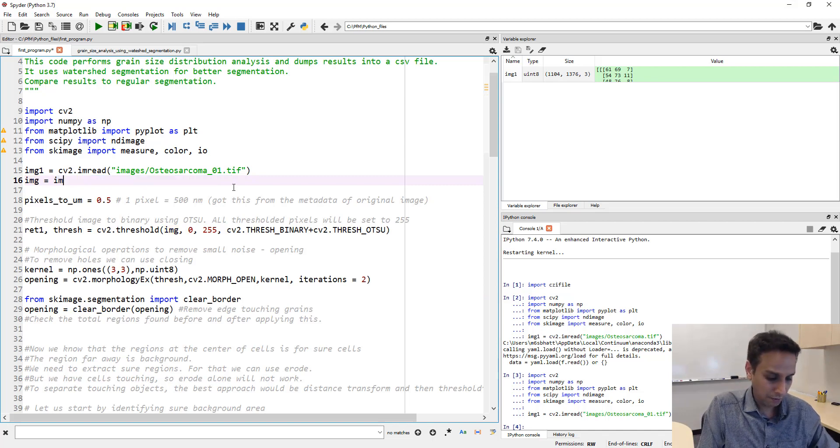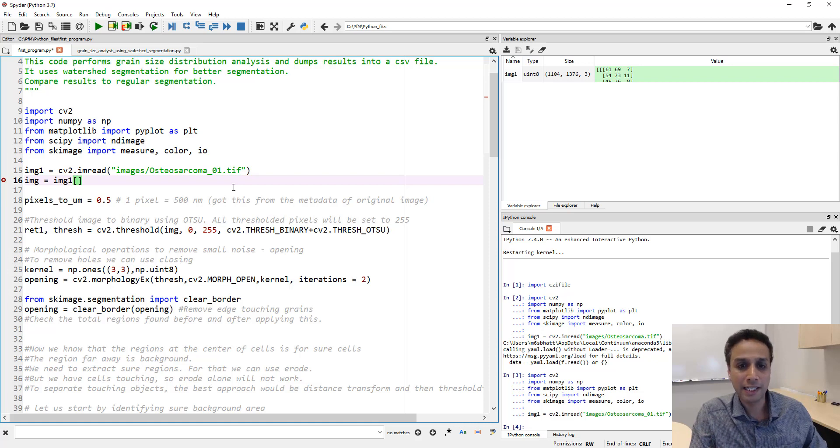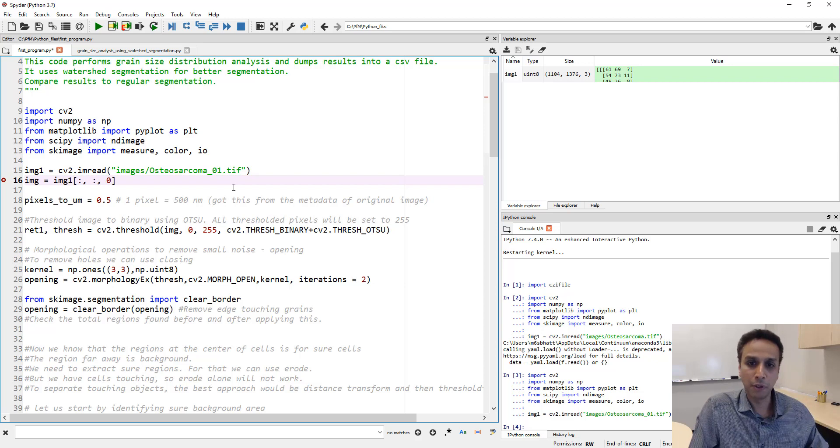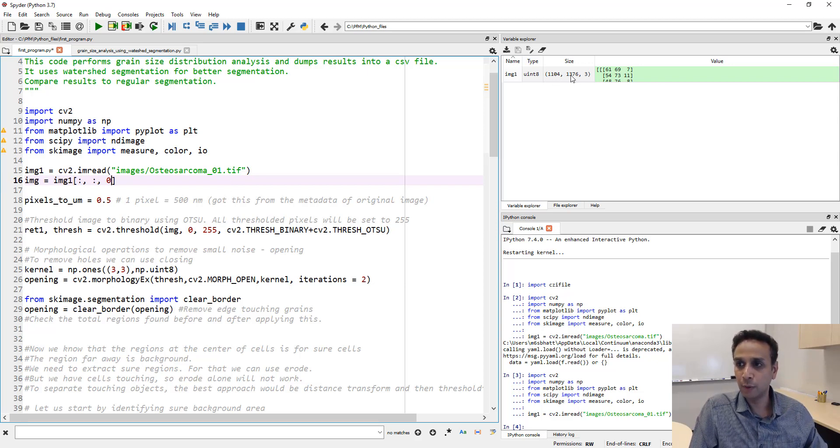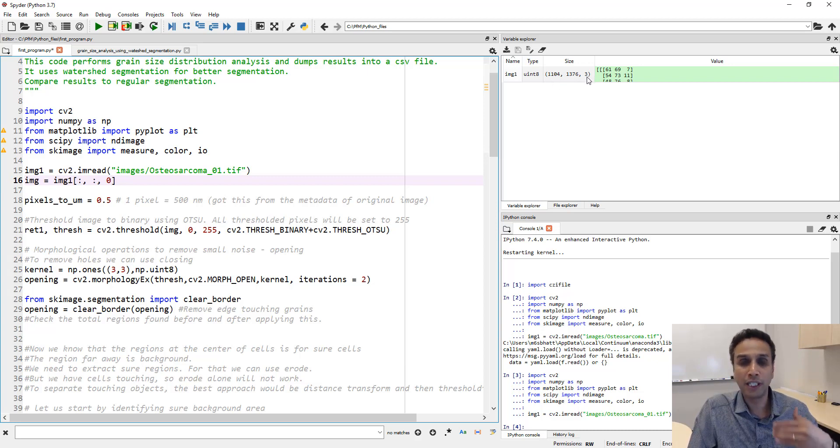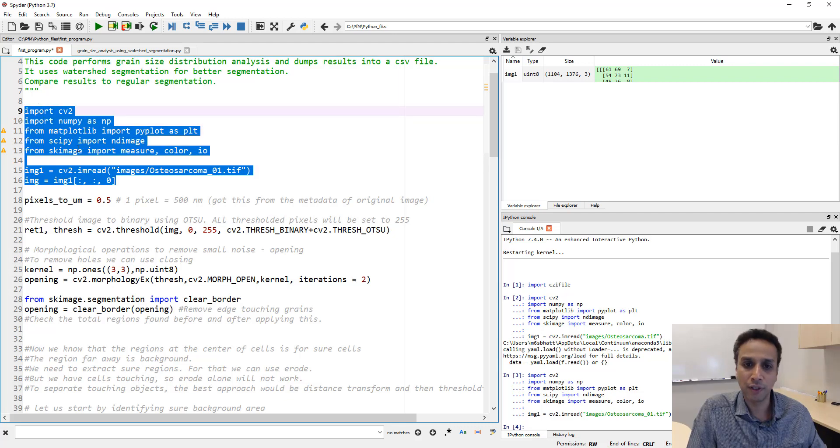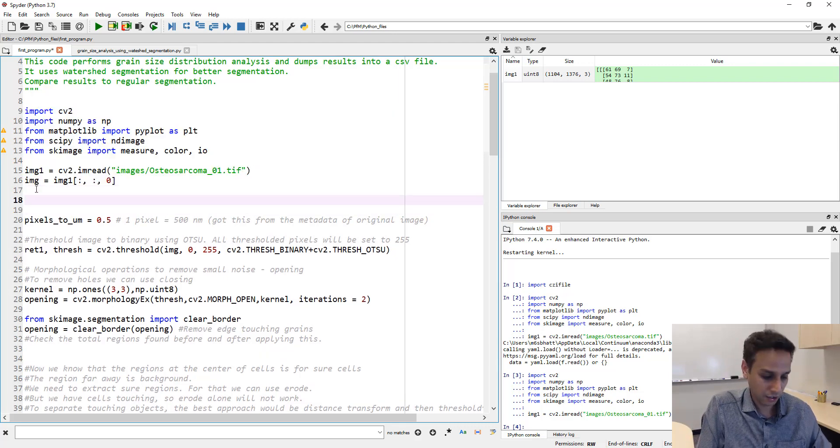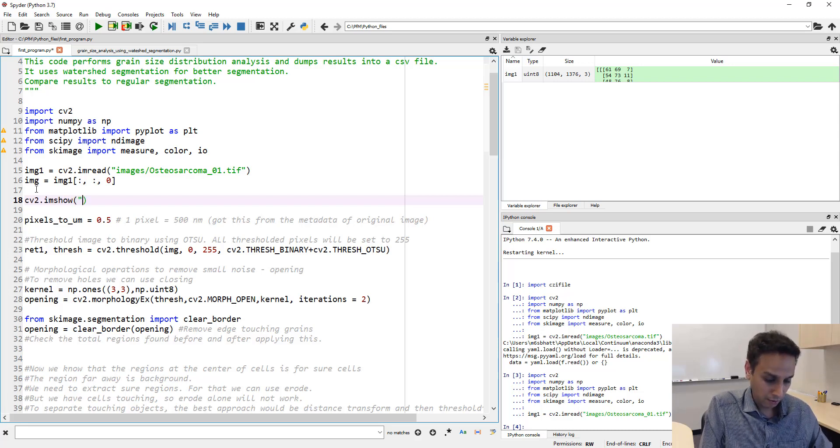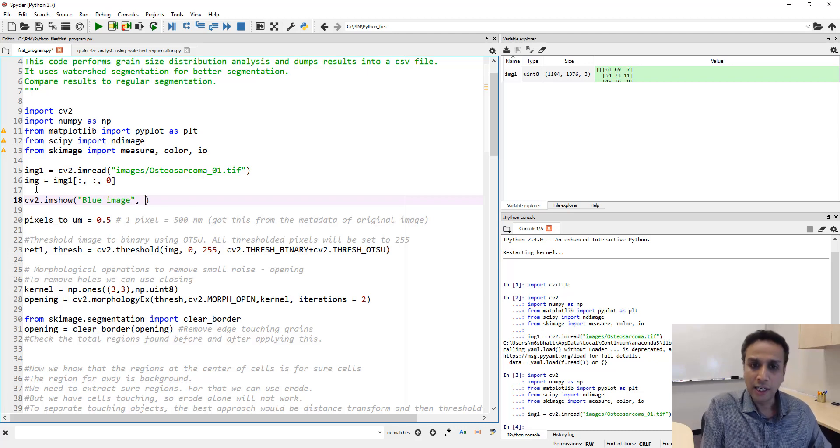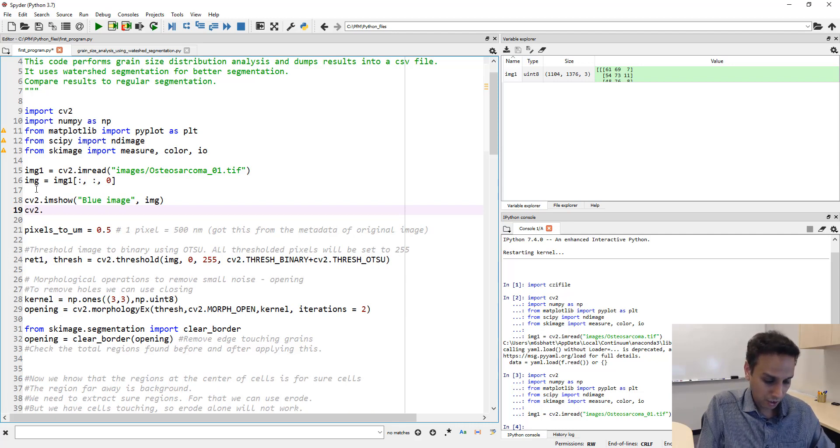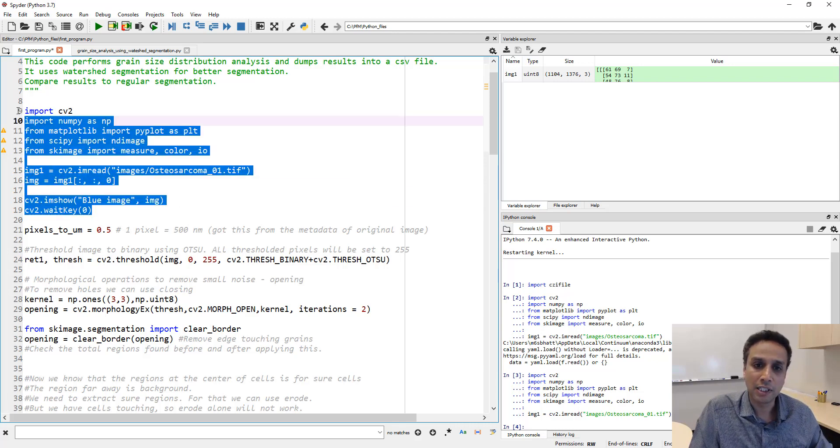The way we do that, as we've covered multiple times as part of our NumPy arrays, is slicing your data set. I want all my x's, all my y's, and I want only the blue channel, the third one. By typing zero I'm getting blue. Let's run this and visualize it. cv2.imshow 'blue image', img, and cv2.waitkey zero. Now let's go ahead and run this.